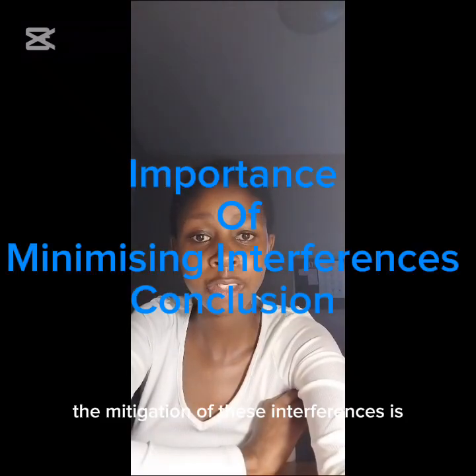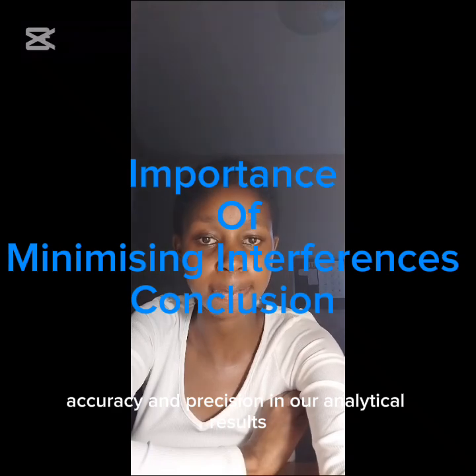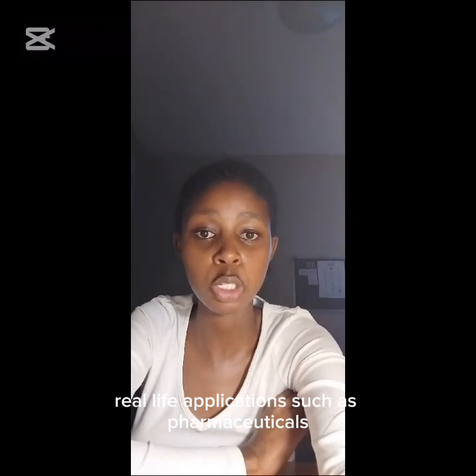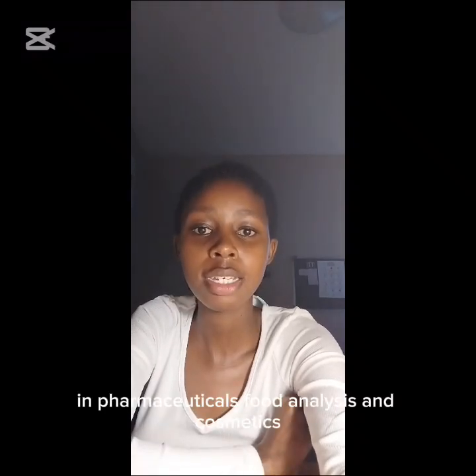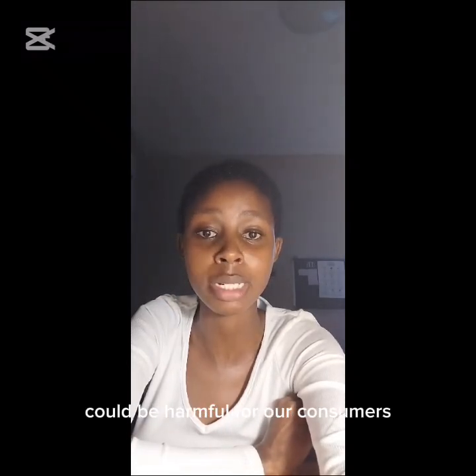The mitigation of these interferences is important to ensure accuracy and precision in our analytical results. It is also important in many different industries, real-life applications such as pharmaceuticals, food analysis, medical diagnosis, environmental diagnosis, and cosmetics. In pharmaceuticals, food analysis, and cosmetics, the miscalculation of contaminants due to matrix effect could be harmful for our consumers and lead to health problems.